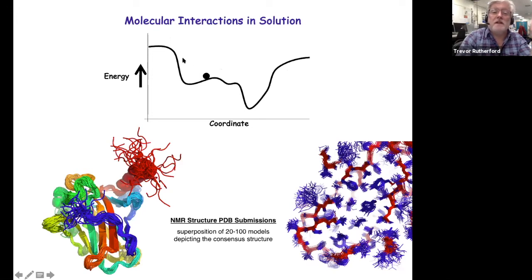As we withdraw the energy from the system, ideally it will eventually sit in the lowest energy state. In practice, we are simultaneously optimizing thousands of different conformational coordinates, so it's inevitable that we can get trapped in a local energy minimum rather than the global state.